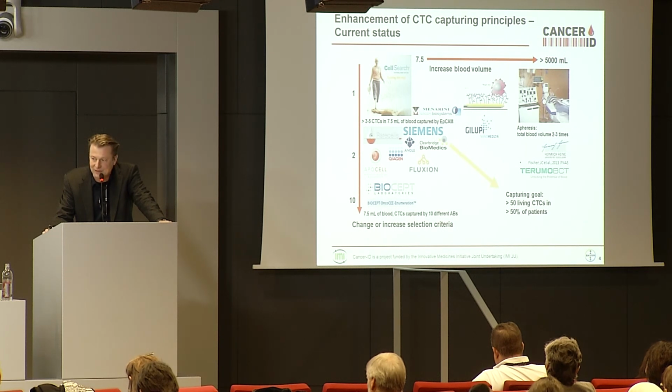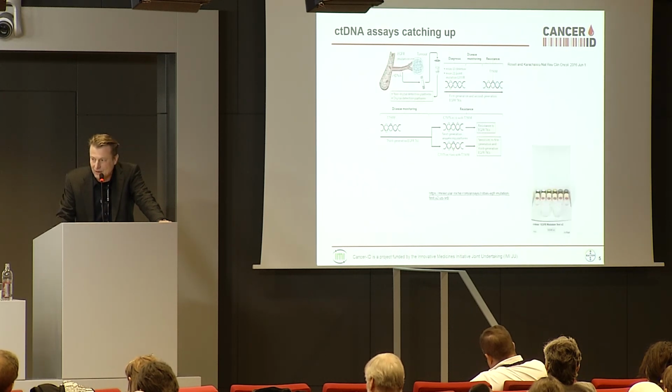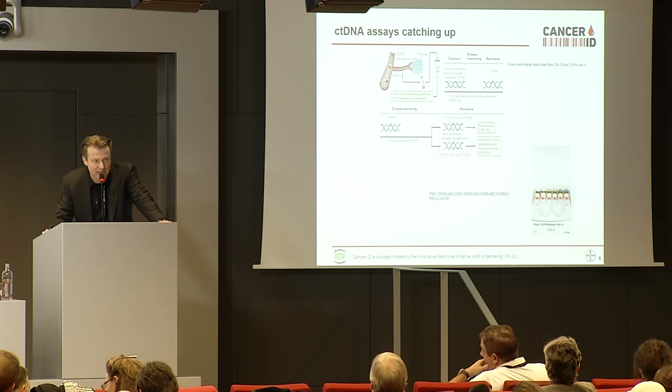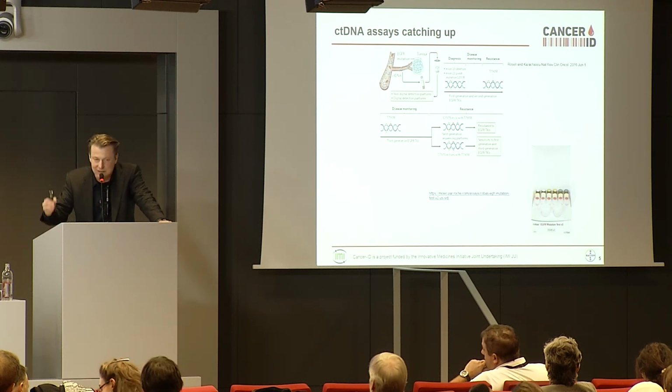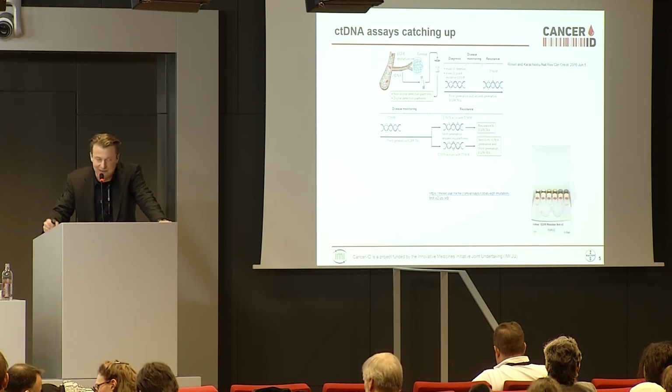And this also applies to lengthy procedures like the DLA, for example, to screen large blood volumes, and whether this will be feasible at some point beyond a stage of research is not entirely clear yet. Okay, what about ctDNA? Currently, this is seen as much more feasible because it's much easier to work with. And here we are back to the pre-analytical sample handling. You can take the plasma, treat it according to the standards, and freeze it down.